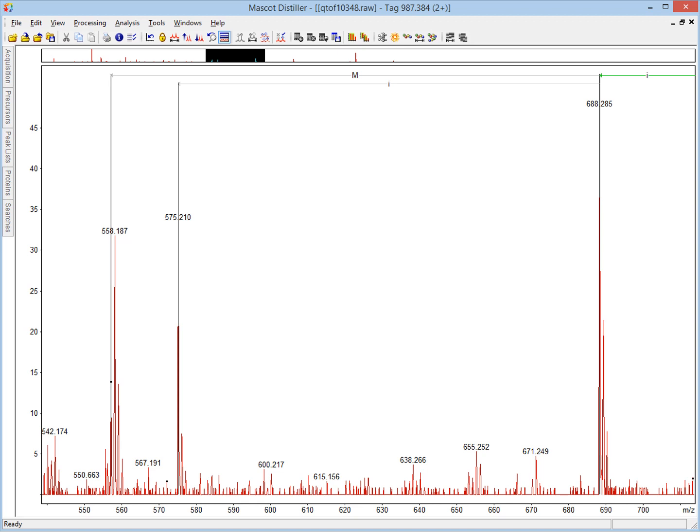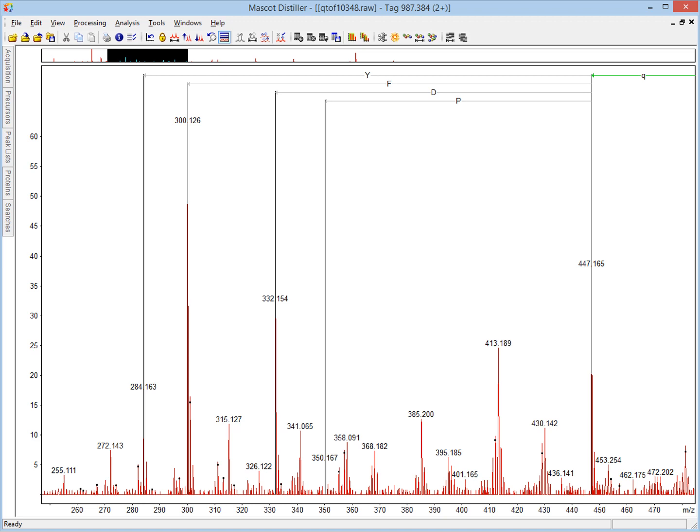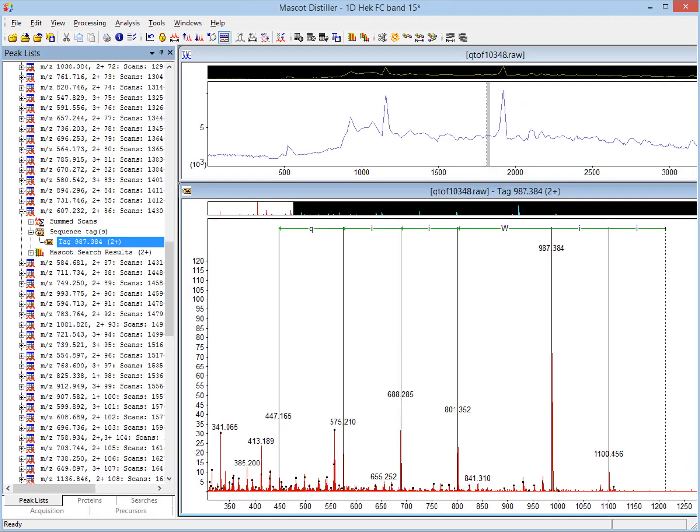Methionine looks a bit dodgy, so we'll go with the isoleucine again. No choice. Good. Lots of choice. Maybe time to give up. Restore the window arrangement. Here's our tag, but is it correct?